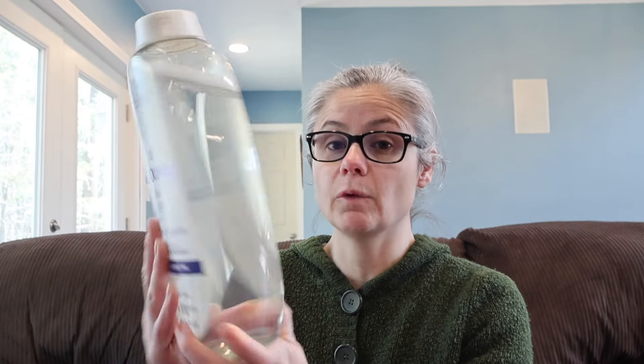I do want to point out that nowhere on this bottle does Downy Rinse and Refresh say they can remove bacteria or make any claims to be able to remove bacteria. We are just testing to see if it can, because that's Catherine's request.